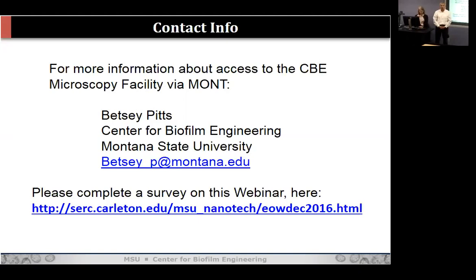Thank you, Betsy. Excellent talk. I'm interested in the inverted confocal. Do you have an immersion medium there? You mean if you have a dish with a cover slip, do you put a water droplet on top of the objective lens?